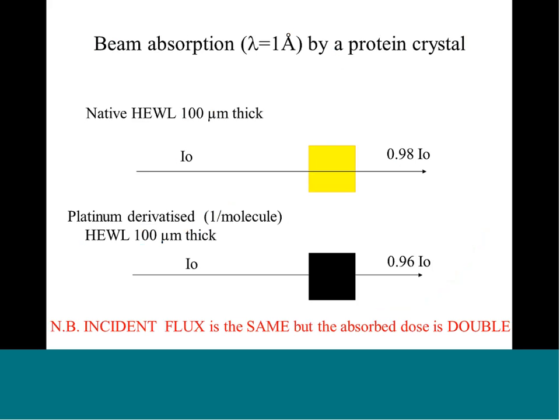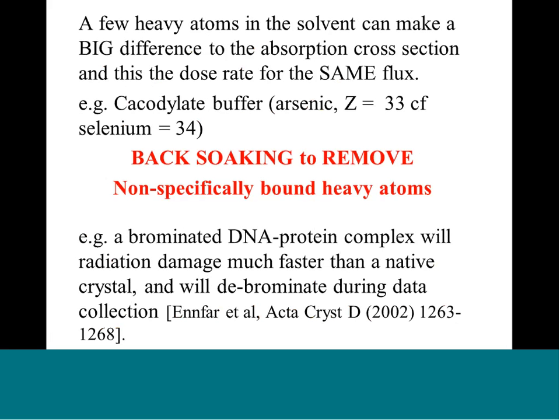What can you do about this as an experimenter? If you have heavy atoms in your solvent that are not contributing to the diffraction pattern and not helping you solve your structure, it's a really good idea to try back-soaking to remove them. For instance, cacodylate buffer has arsenic in it — Z=33, very similar cross-section to selenium — and brominated DNA–protein complexes will damage much faster than non-brominated ones.